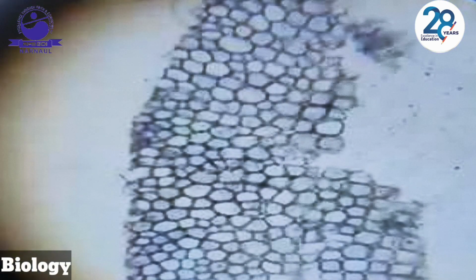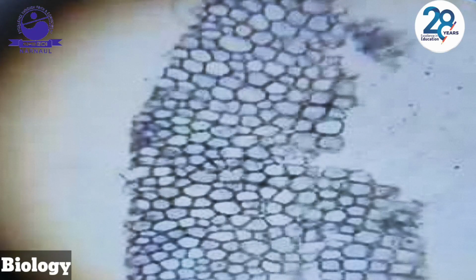Dear students, this is the collenchyma. Collenchyma consists of thick cell walls. Previously in parenchyma, we had thin cell walls; here the cell wall is thick. The cell wall is made up of cellulose and pectin. Collenchyma also has a distinct nucleus. They have dense cytoplasm, more cytoplasm as compared to parenchyma cells.